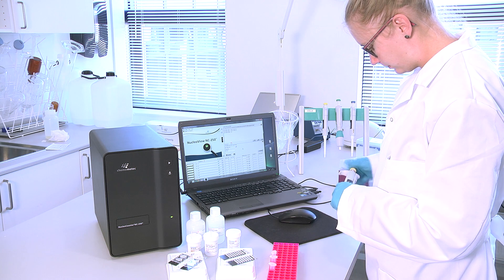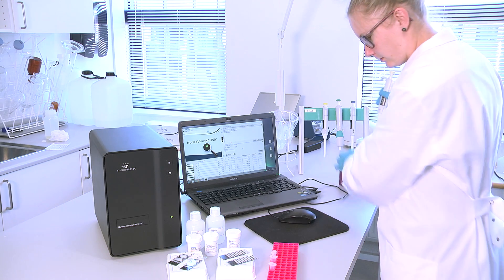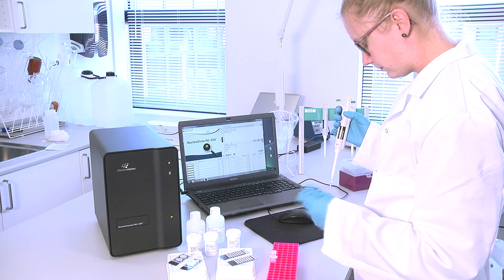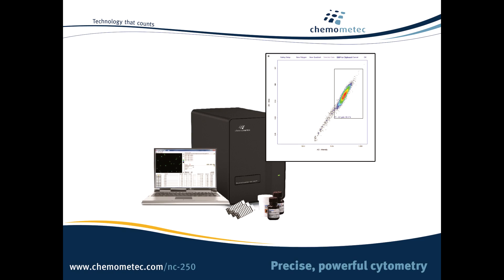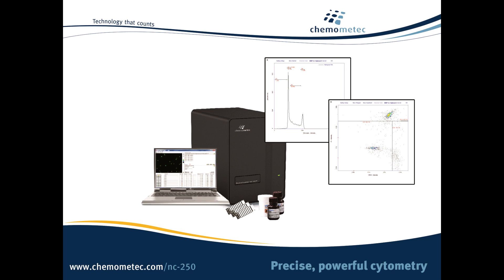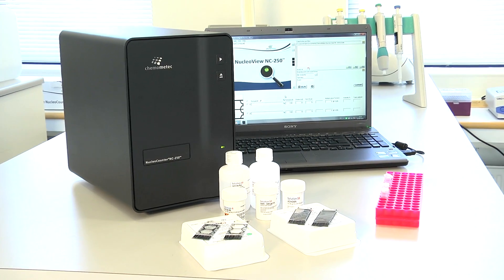In addition, the NC250 is 21 CFR Part 11 ready and can be validated easily with the included IQ and OQ assays. If you need rapid, flexible cell counting with the added power of advanced assays, then the Nuclear Counter NC250 has a place on your bench.